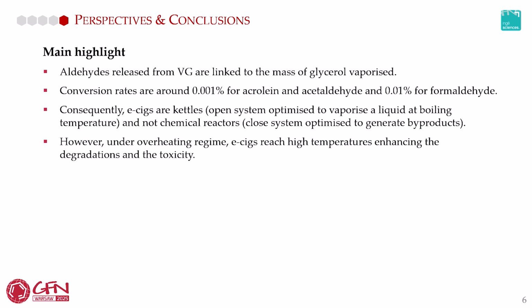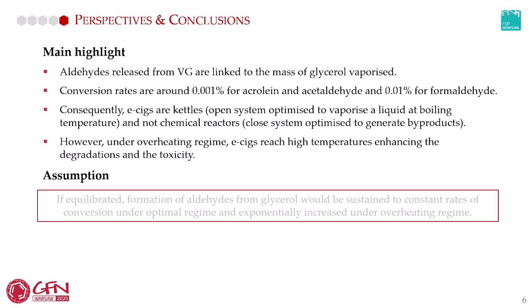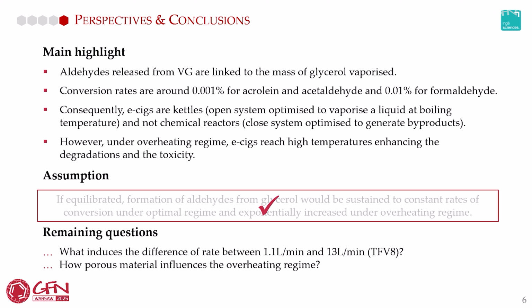Experimenting in overheating conditions with settings above maximal power results in significant conversion rate and leads to overestimating the risk by many orders of magnitude compared to optimal and relevant conditions. Our assumption seems to be validated. However, there are remaining questions that need deeper investigation. Many thanks for your attention.